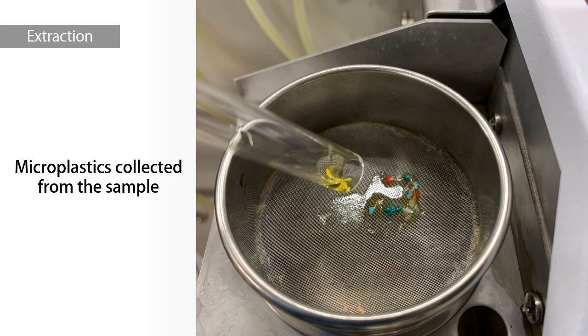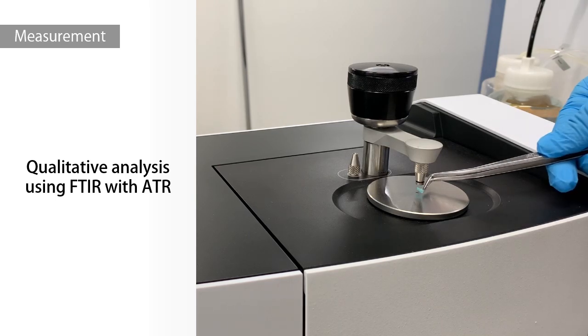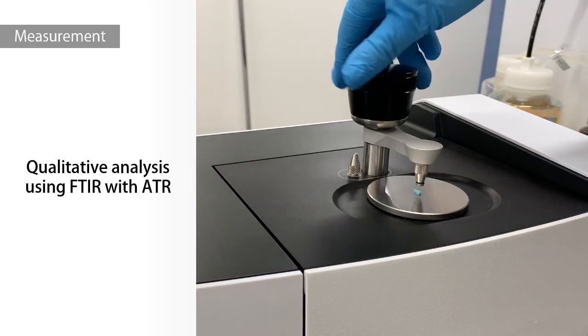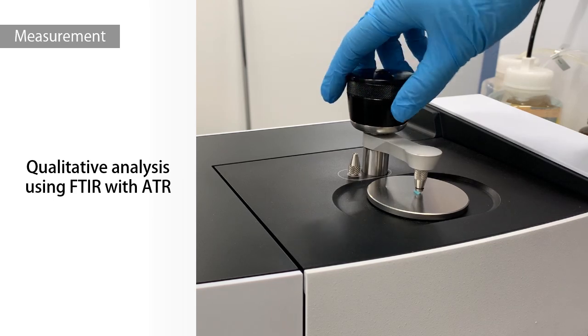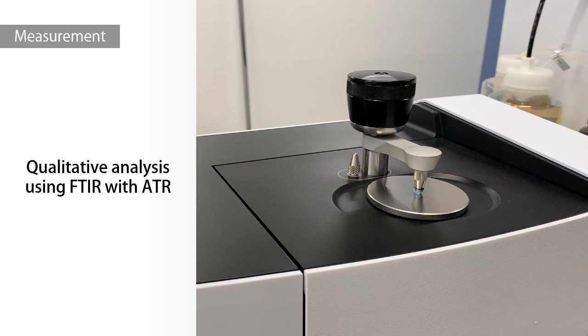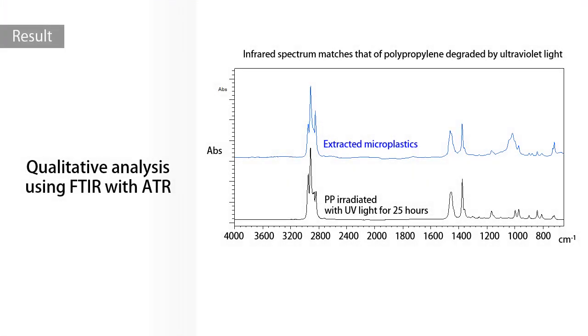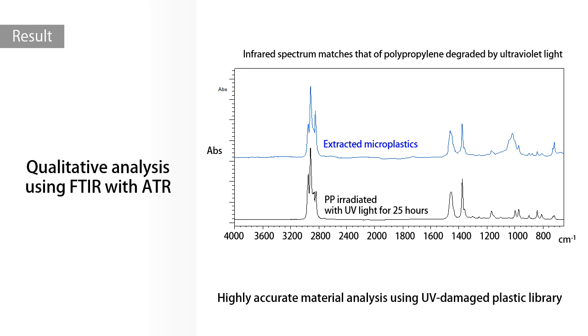These are microplastics collected from the sample. We picked the collected microplastics and evaluated their material quality using FTIR. Analysis can be easily performed using a single reflection ATR attachment. The obtained infrared spectrum revealed that the plastic was polypropylene that had been degraded by ultraviolet rays. It is possible to perform highly accurate material analysis using the Shimadzu Original UV Damaged Plastic Library.